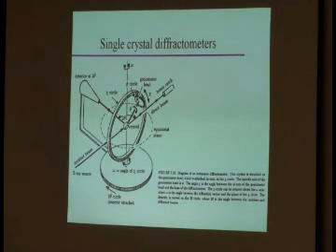What does a single crystal diffractometer look like? Here's your pulling it all together picture. Basically what you have is an X-ray source, goes onto a crystal, which is mounted on a goniometer head, which gives you some rotational degrees of freedom of the crystal. That whole thing is mounted on a circle that can also be rotated. But once again, your crystal stays here. It's at the center of the circle. You can also rotate that one in this direction, or you can move your detector.